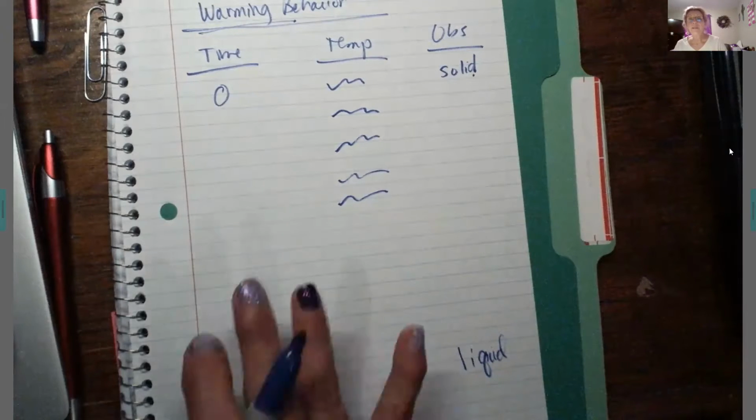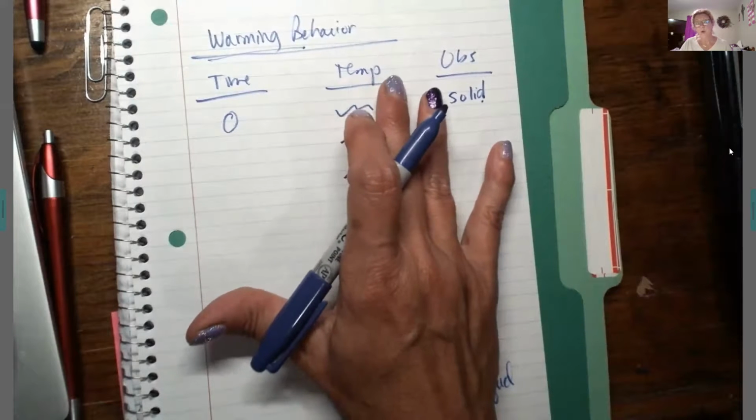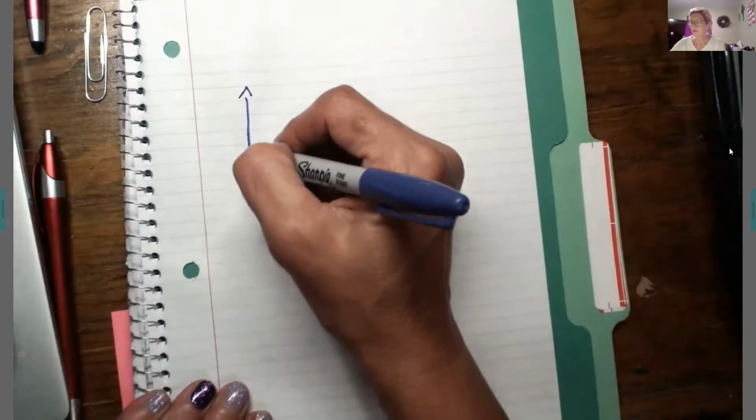Now, in the meantime, for this to happen, you've used some boiling water, or not quite boiling. You've gotten it hot. You do not want it totally boiling. Again, follow the directions on the lab handout. So the point is that you're going to collect this data, and then when you're finished, you're going to clean up everything, and then you're going to make a graph.